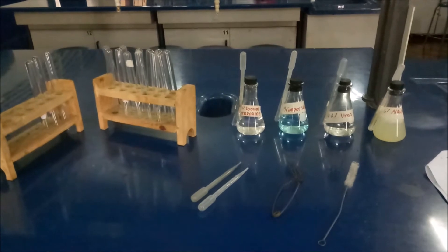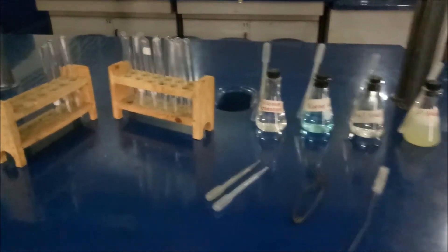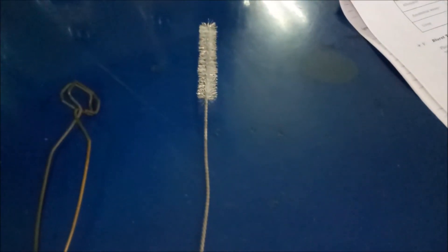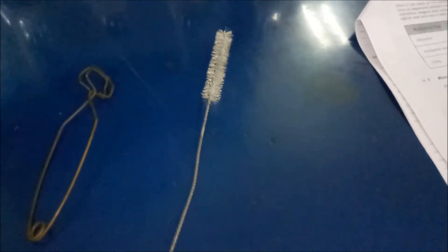So for the materials that we need for the biuret test are: test tubes and test tube rack, droppers, test tube holder, and test tube brush for cleaning the test tube.